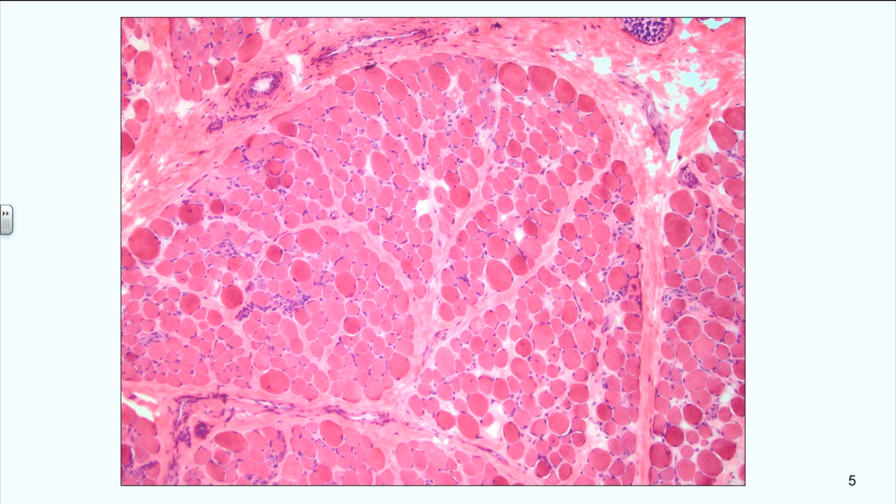And then because probably this muscle has gone through episodes of degeneration and regeneration, and at some point it has lost the capacity of repopulating the fascicles with normal myofibers. So what installs instead is scar tissue. And the other thing that we see here, looking at this low magnification, is the fiber size. You can see that many of these fibers are very small. And also many of these fibers have internal nucleation, which is not normal.